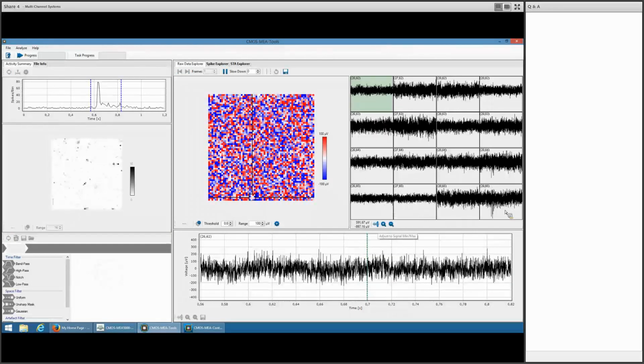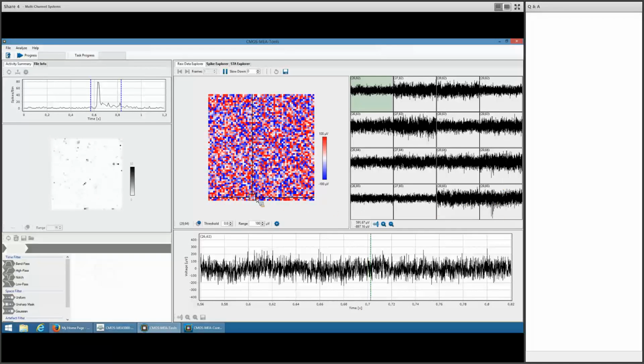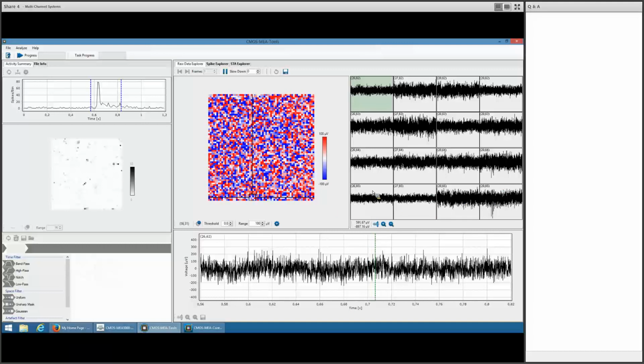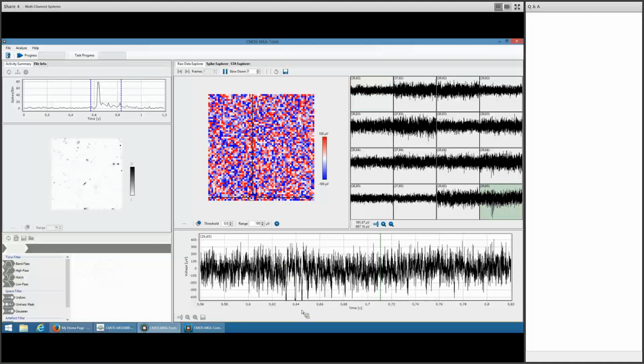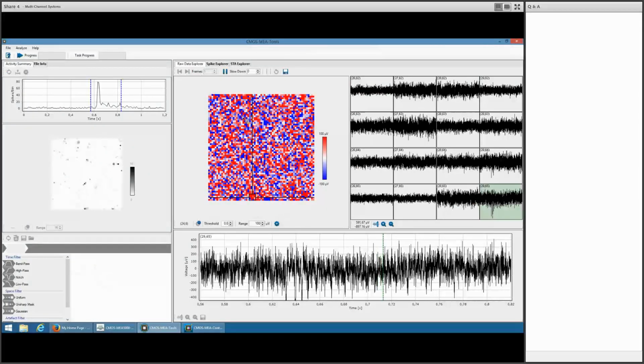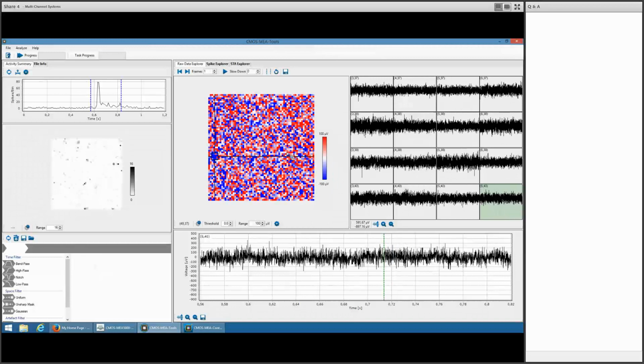and there are several spots within that culture. That was from a hippocampal culture preparation, where I actually have quite nice spikes. So for example, this here, that blue spot means that I have very negative values within the 200 millisecond bin, and that probably means that there's activity. And when I zoom in, I see that activity.